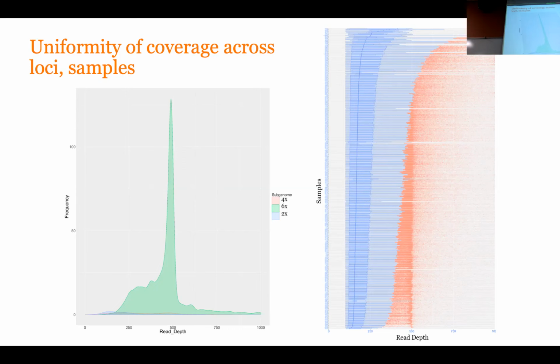So you want to be able to go into your data and remove those things, right? It's not enough to just generate your VCF file. You have to be able to say, what are the useful SNPs that map to a unique locus in the genome, right? And that's an entirely different problem in the pipeline. Something else I've showed you, right?